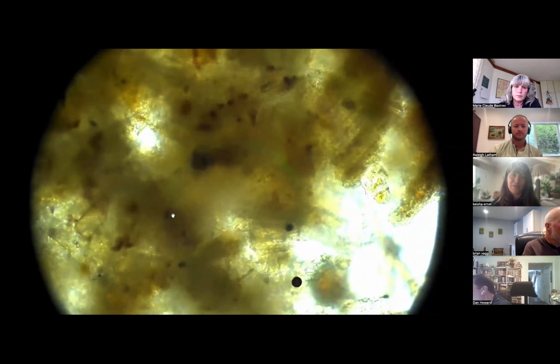And that could be cool, Brian. Why don't you keep this test tube for another few months, and let's look and see who's left then? Because I've done this test before, and what happens is there are some gnarly aerobes. Some nematodes can last forever, and they just start eating everybody, spearing everybody. They start acting different than they normally would. But eventually it's an empty room and there's just a few ciliates maybe ticking around or just some bacteria. There's nothing left. It all gets consumed.